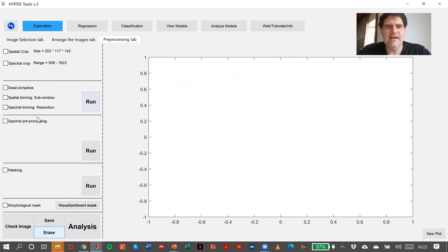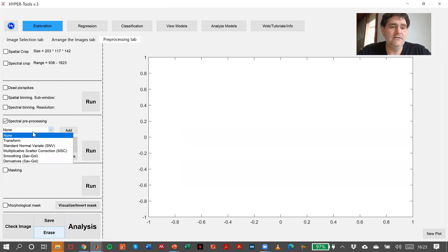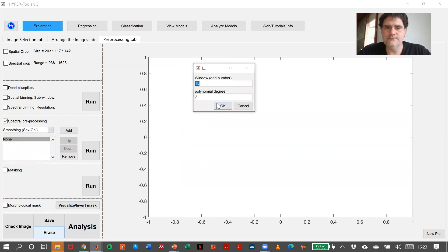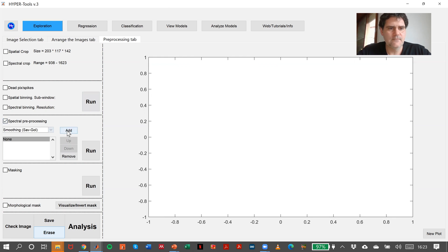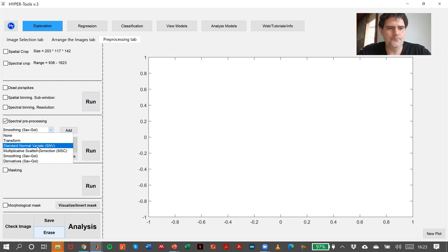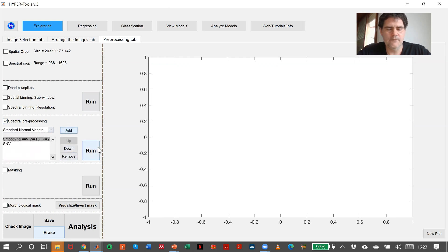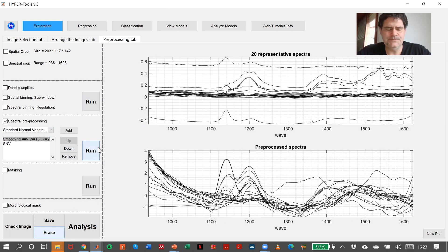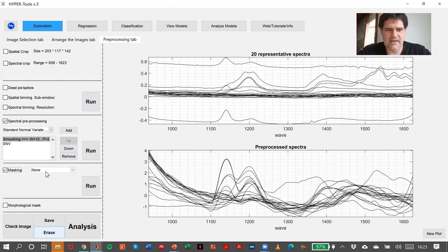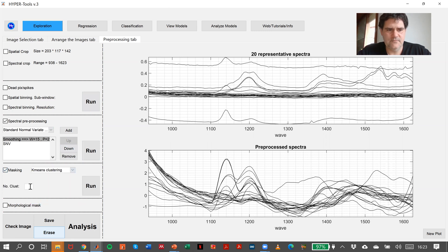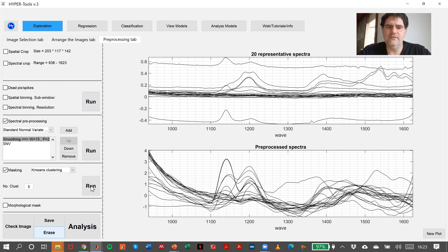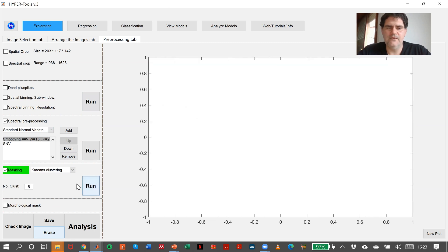So the option that could be good here is to erase, and make again a little bit of smoothing, SNV first as a first operation. And now let's say K-means number of clusters, five. Let's see what happens now.